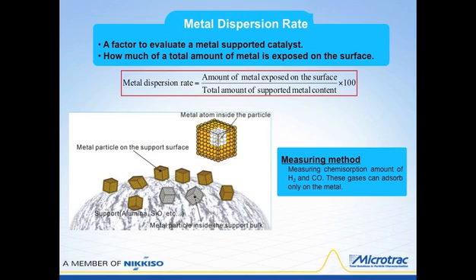materials. And again, this is called the metal dispersion rate, and this is a means of determining the availability and the quality and the capability of the catalytic converter to convert noxious to less noxious gases.